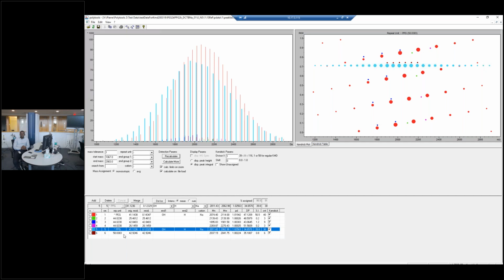Thank you, Pierre. Another question about TLC techniques. Are these normal silica gel TLC plates? These are aluminum backed, yes, silica gel TLC plates. Thank you. Next question. Were MS images automatically generated? So I guess they came directly from the instrument in that sense. Yeah, that's quite broad.